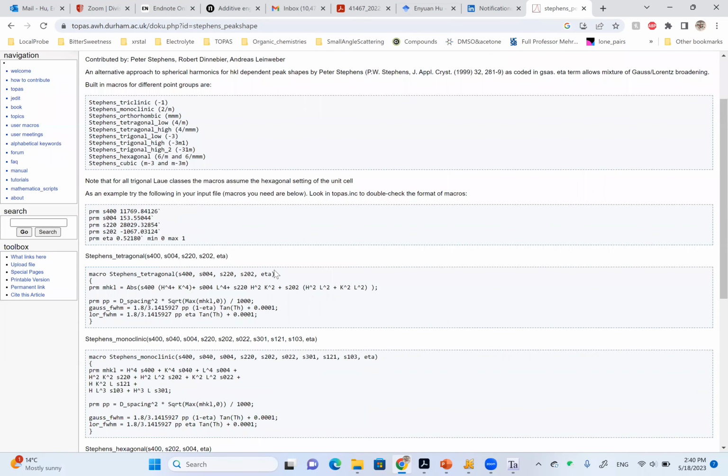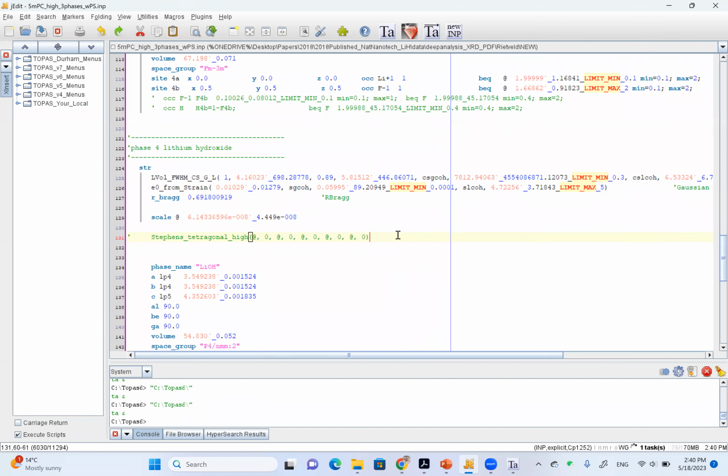So you need to put in 5 parameters, and the way to do that is, at, comma, a number. By default, you can just put in 0, right? And then comma, and then at, comma, another number, and you write that for all the 5 parameters. And that's the way to do the Peter Stephens fit for the anisotropic case. Okay. So at least I think you should have knowledge about this anisotropic profile function.